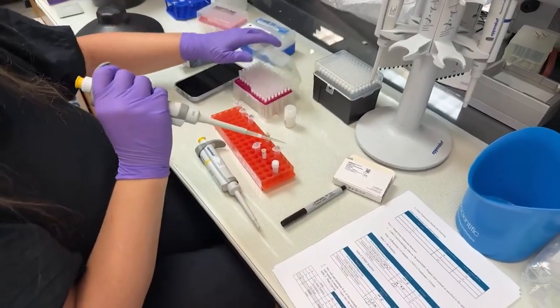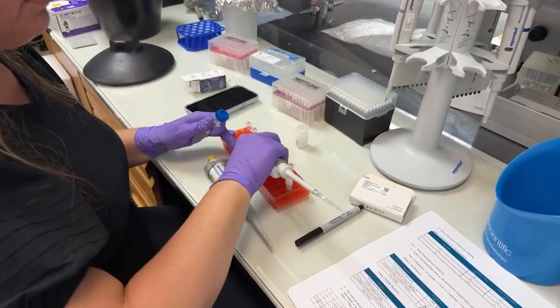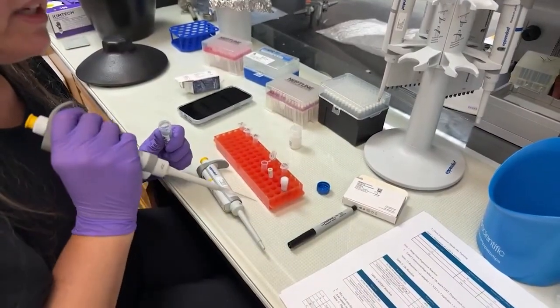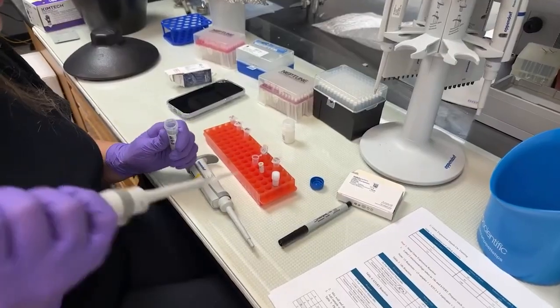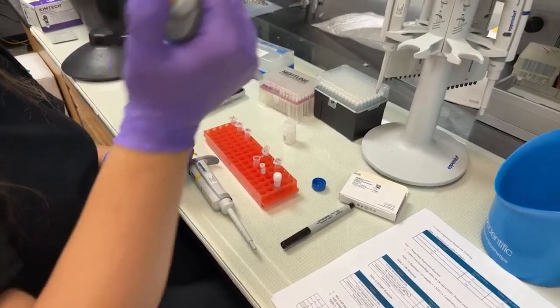Yes, there's different kinds of water. There's DI water, there's nuclease-free water, but by definition, a nuclease is going to degrade DNA or RNA. We want to keep that out of our reaction or nothing's going to be accurate. So make sure you have some high-quality water that you're using for the experiment.